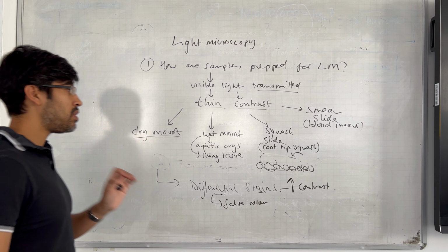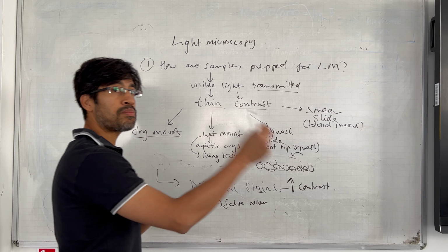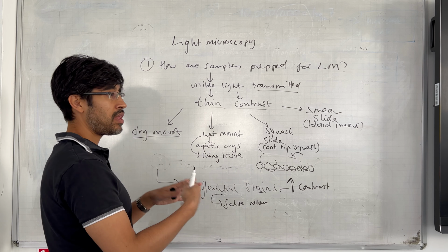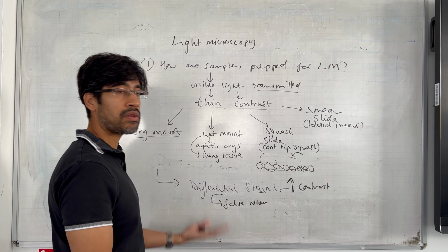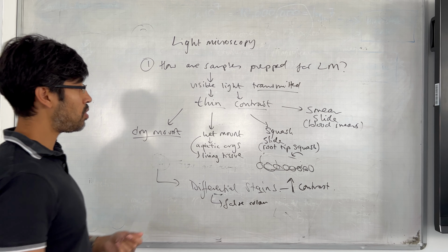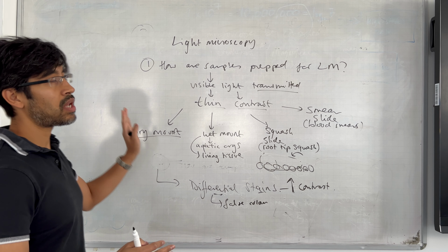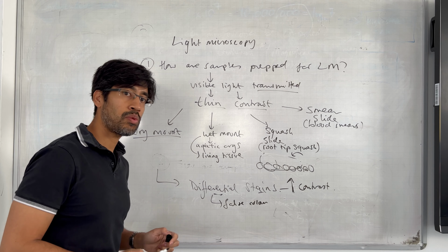Okay, it does increase contrast. It allows us to see specific structures or parts of the cell. That allows us therefore to identify cells, identify cellular components, and so on. Okay, so that is all about slide preparation. We move on to our second question.